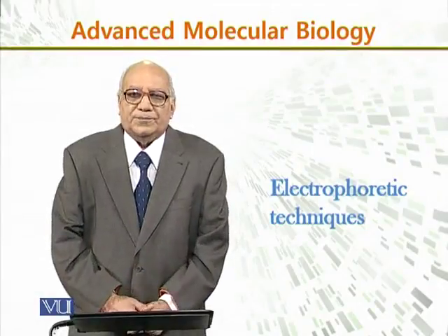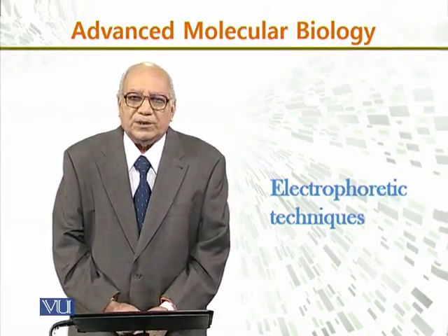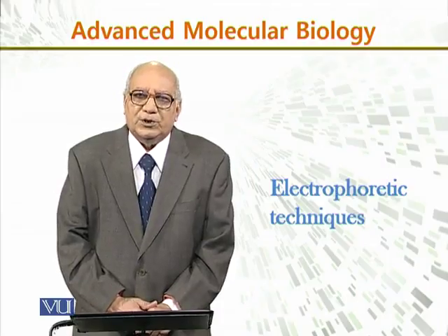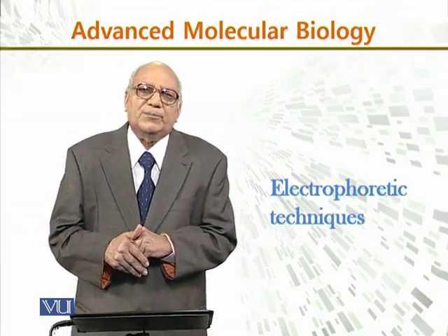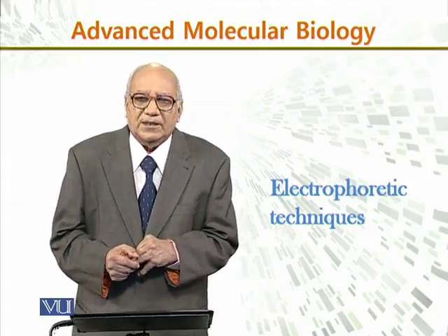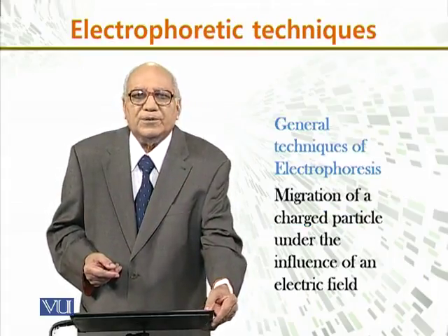In this module, we will discuss another important technique which is used routinely by molecular biologists to determine and to characterize nucleic acids and proteins. The technique is known as the electrophoretic technique, that is, the electrophoresis of these molecules.